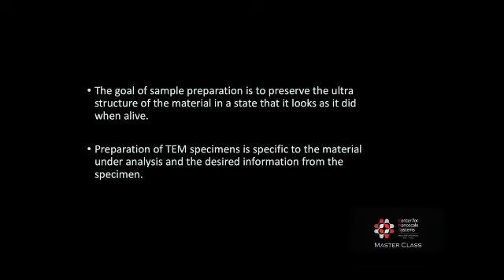So what this tells us is that biological electron microscopy requires special and careful preparation of our samples. The goal here is to look at biological tissue, and we want it to look as it did when it was alive, but when it's in a microscope under high vacuum and being bombarded with electrons. This is the challenge that we had to overcome.